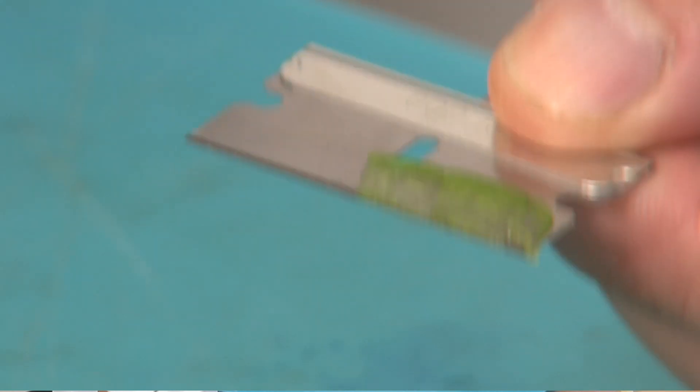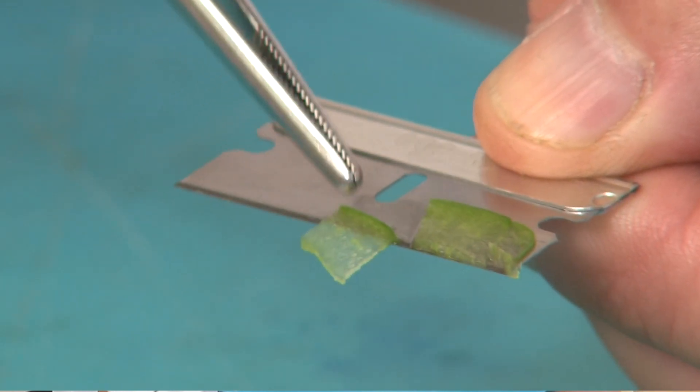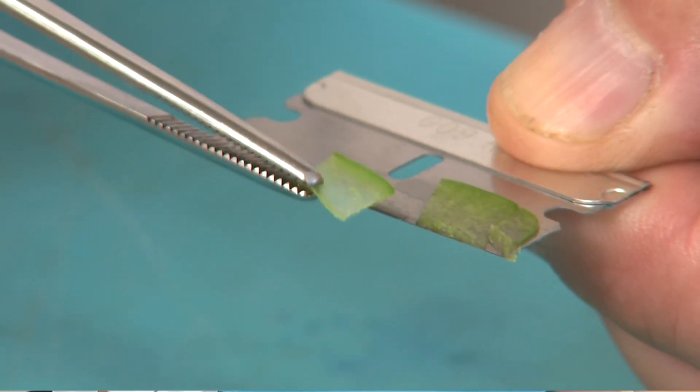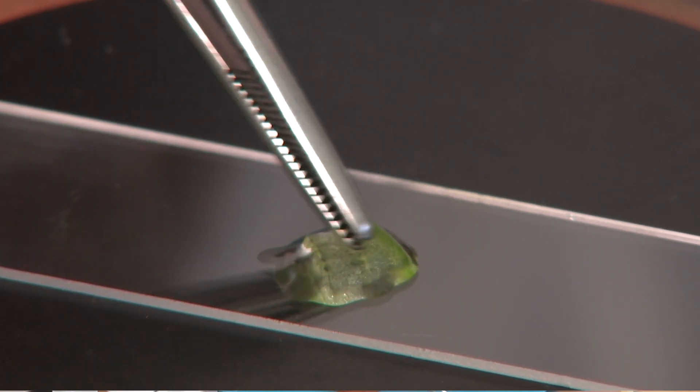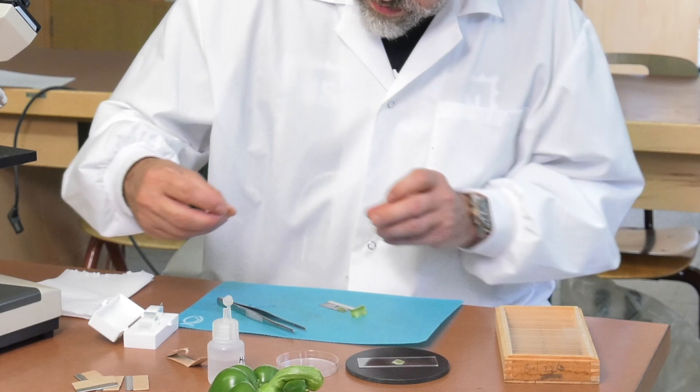Select the thinnest section and use forceps to transfer it to the drop of water on your slide. Carefully apply a coverslip.